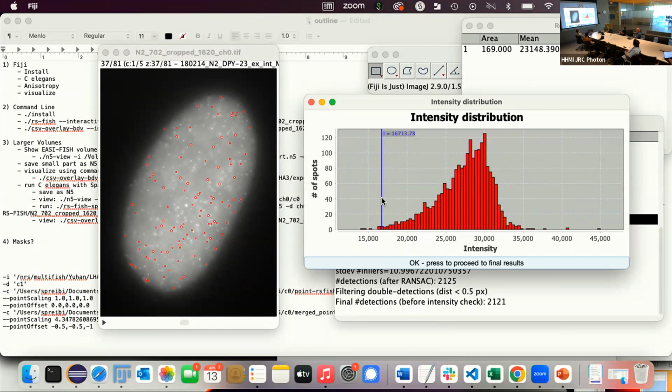Exactly. 0.5 pixels in X and 1 pixel in Z. Because then you run it with Cellpose, right? Or some detection that's again Python or Java based, right? And they again have different offsets. Because in MATLAB, an image starts at index 1, not at 0. They are 1-based. And then you have to decide where your pixel is, right? Top left corner, middle, these types of things. So you have to be careful with these things if you go from one software to the other to access pixel values of the same image.